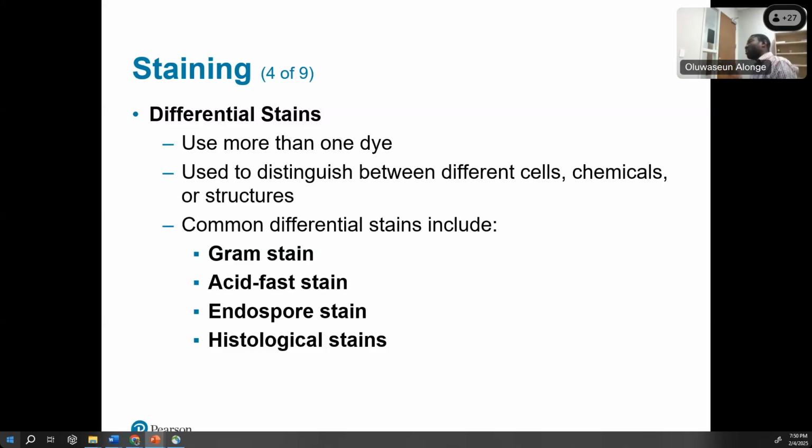Okay, now. Yes, I know about gram-positive, gram-negative. Very good. So gram-positive bacteria, you see them, they will be purple. And then gram-negative, you see them, they will be red, pinkish. Now, when you see them, it is because the stains that they picked up are different. I'll show you an image now.